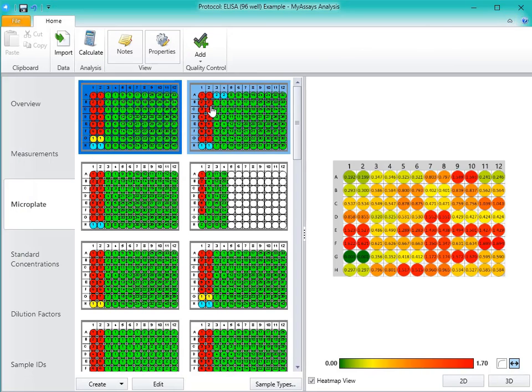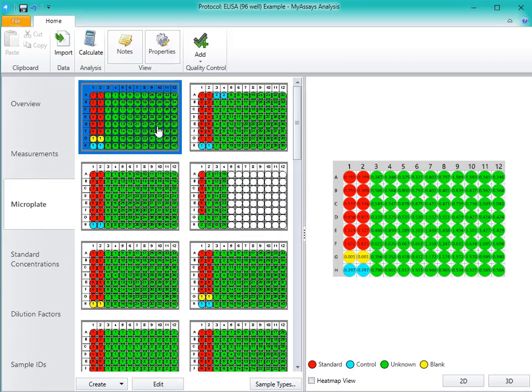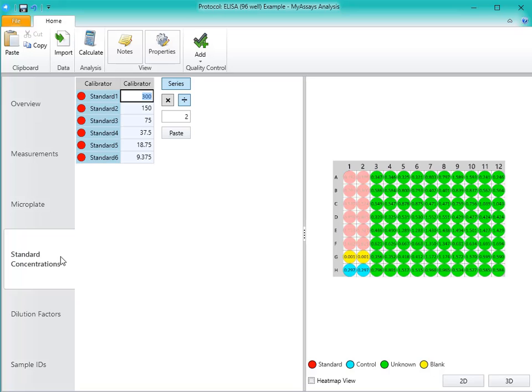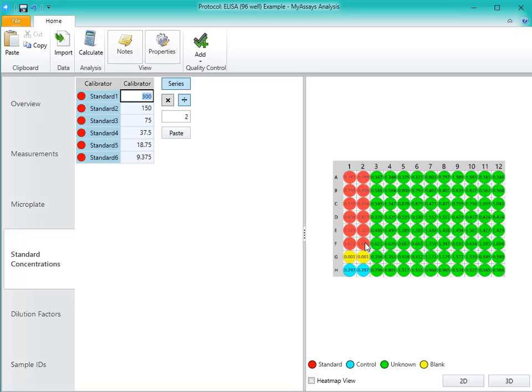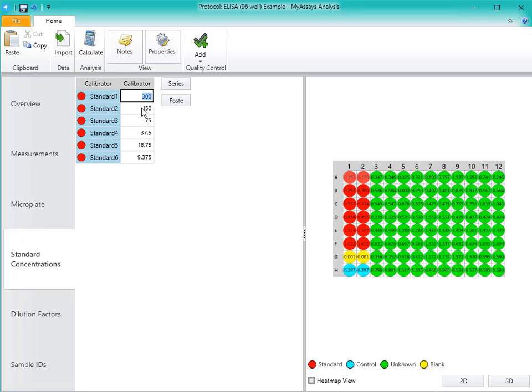Once we're satisfied with the plate layout, we can move to the Standard Concentrations tab. Here we can define the concentrations of our standards. You'll see visual feedback in the pane on the right-hand side of the screen. With the Series mode turned on, all the standard samples will flash. And with the Series mode turned off, only the standard that's currently selected will flash.